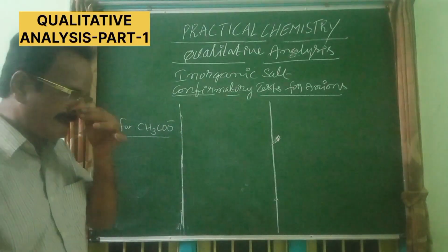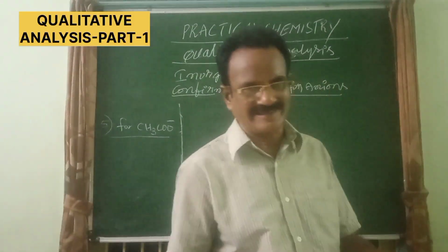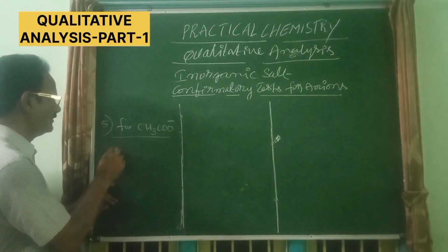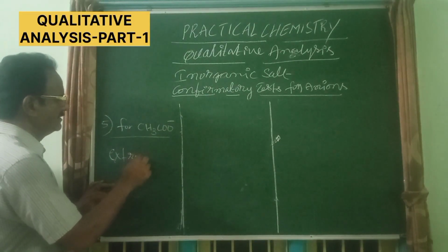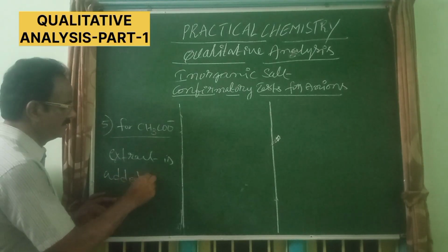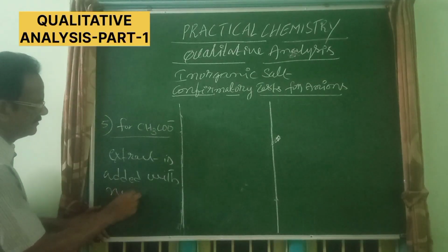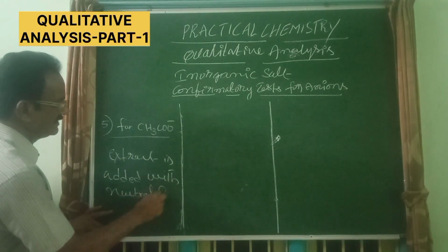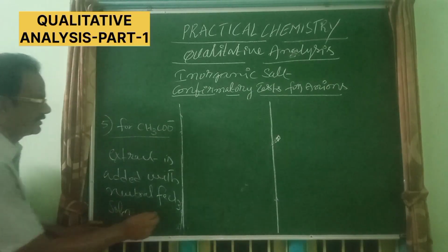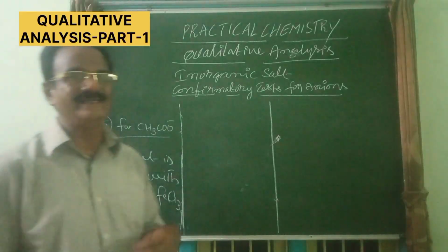Okay, here also the tests may be exchanged for identification and confirmatory. See here, the extract is added with neutral FeCl3 solution, and then heated.